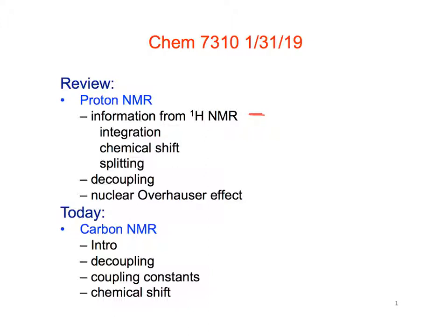So today we're going to start into C13 NMR. We're not going to go that much into theory because the theory is mostly the same, how signals are generated and things like that. But we will have a little intro like that. We'll talk about decoupling, coupling constants for carbons, and then we'll probably at least start talking about chemical shifts.